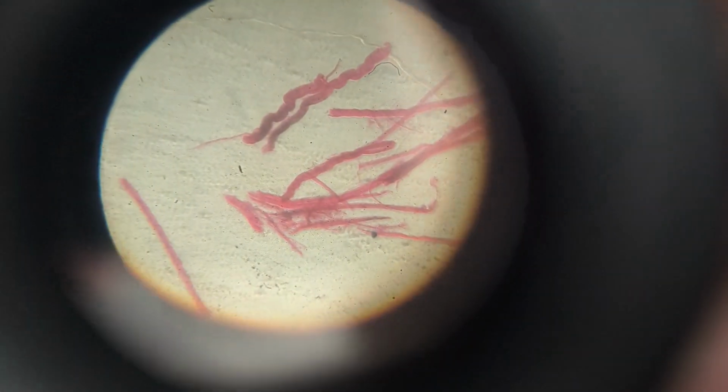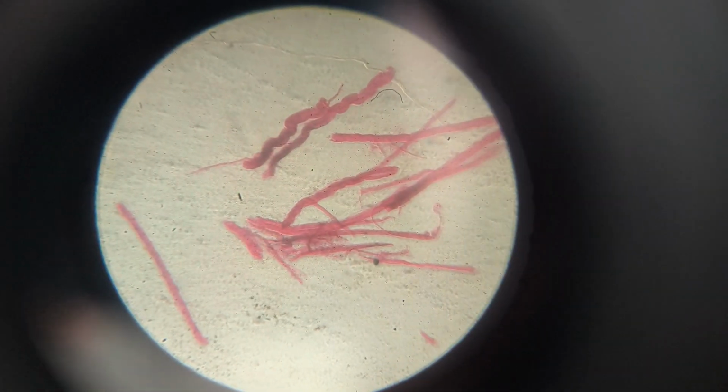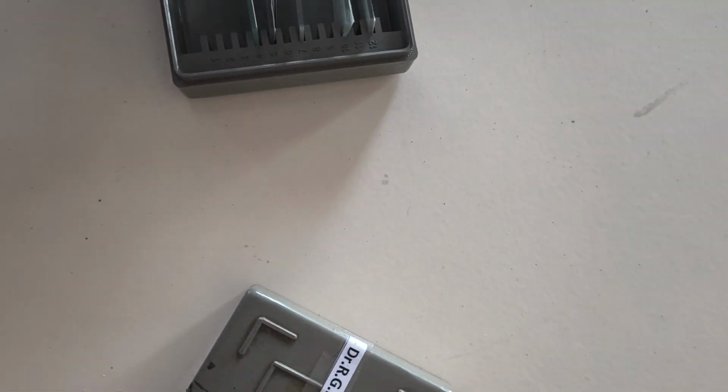This is the hookworm. These are tissue muscles. These are muscle tissue. I'll show you some more slides.